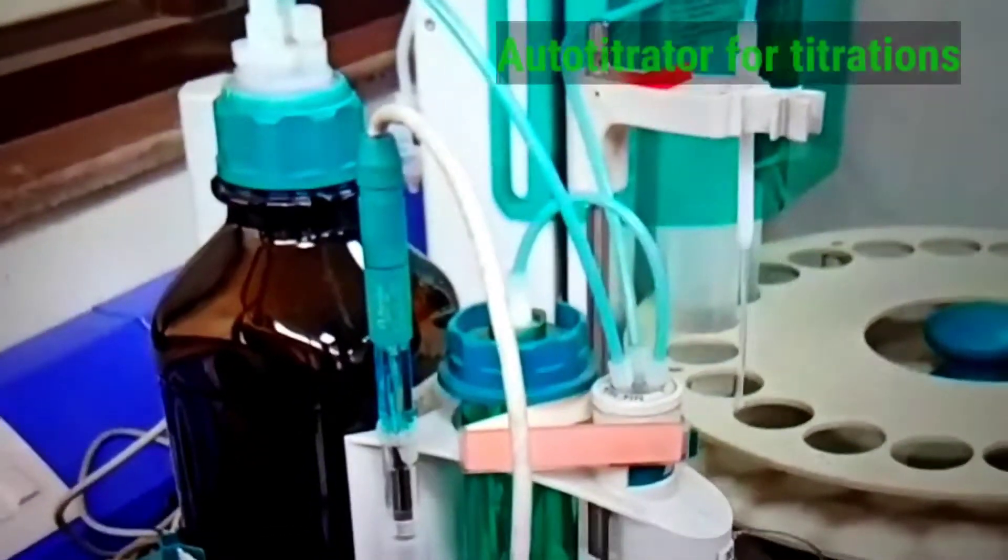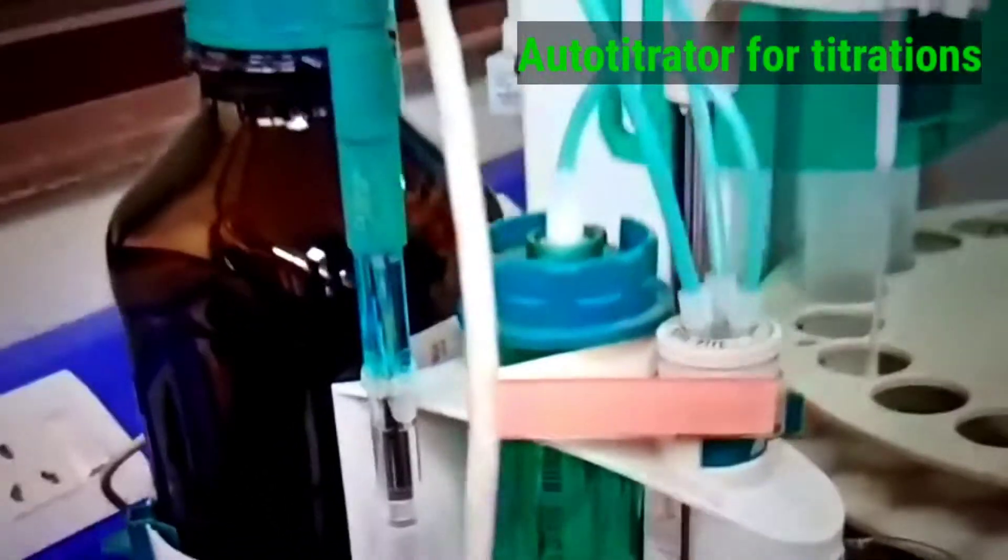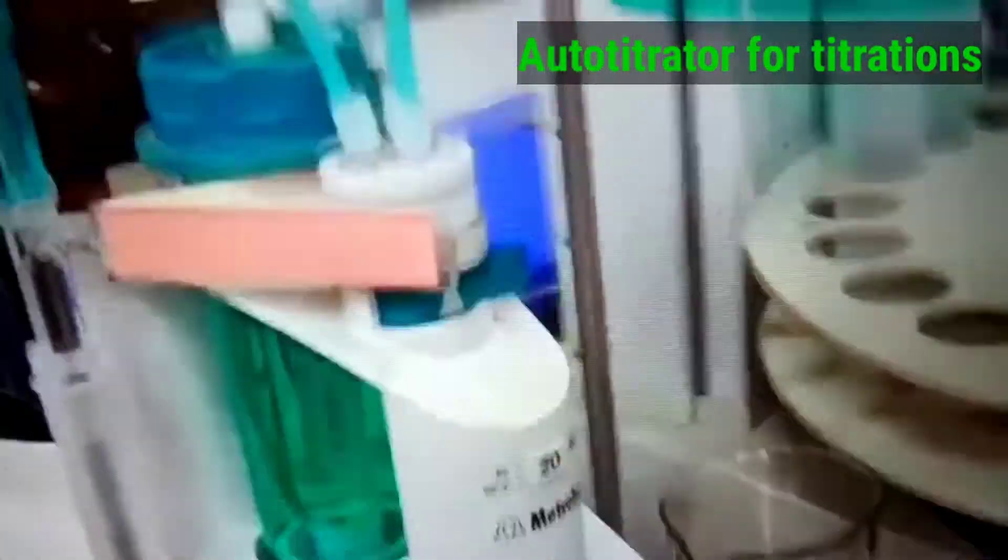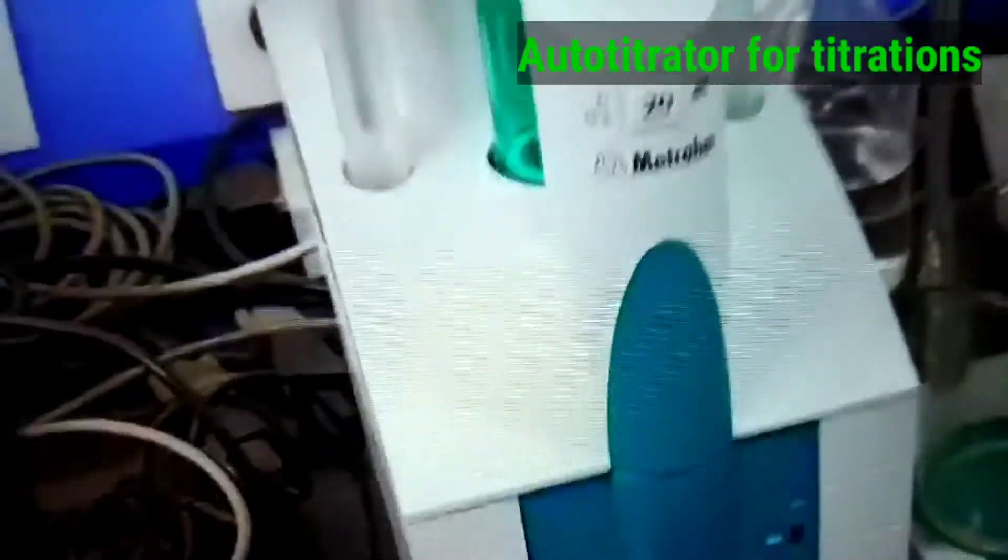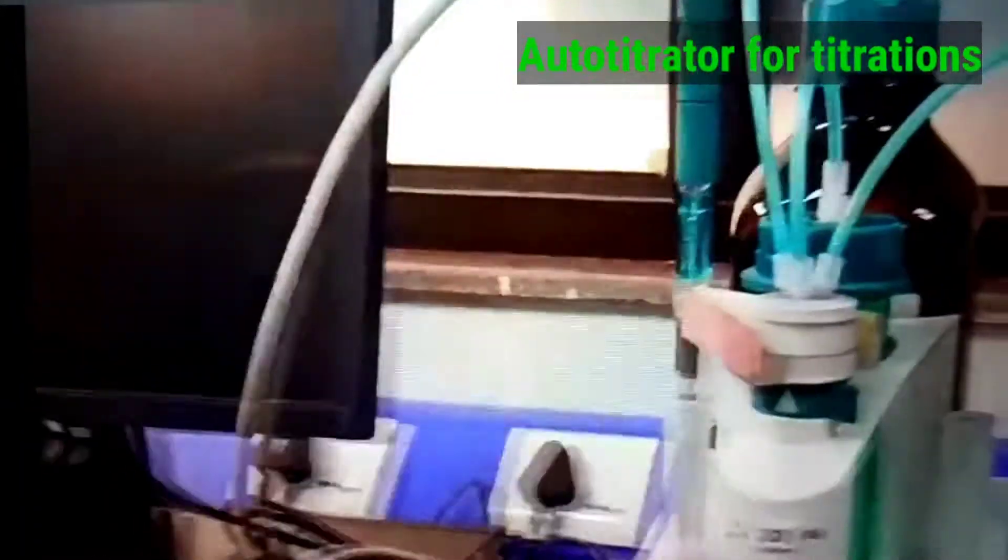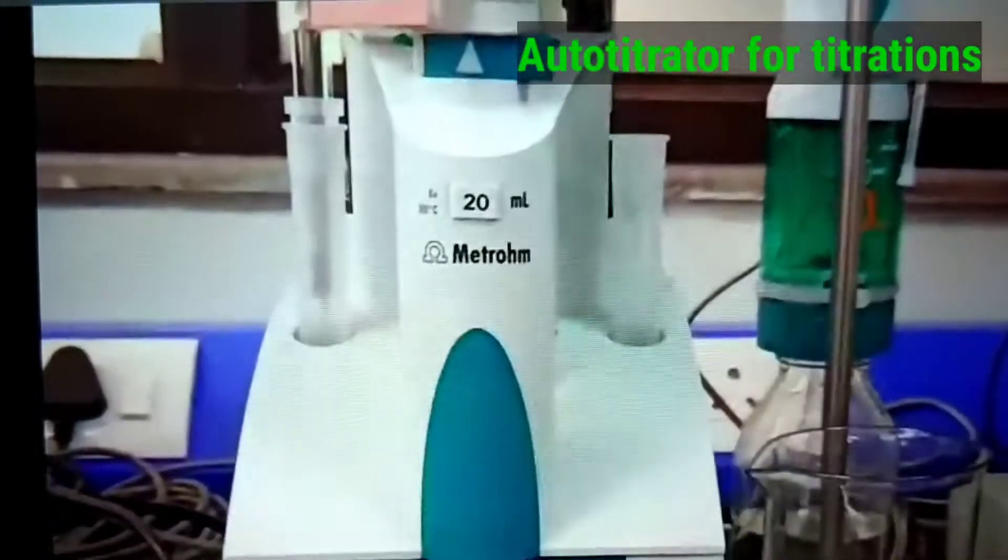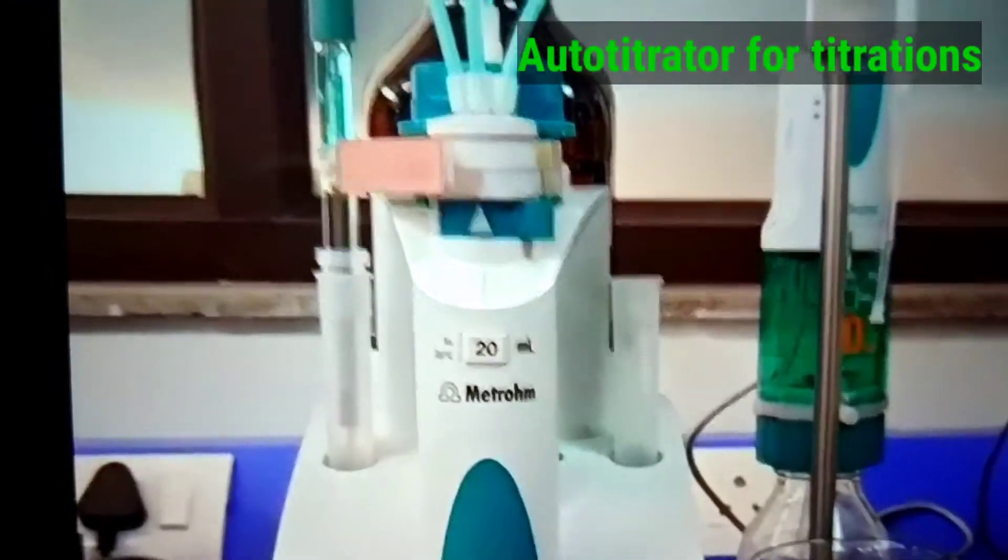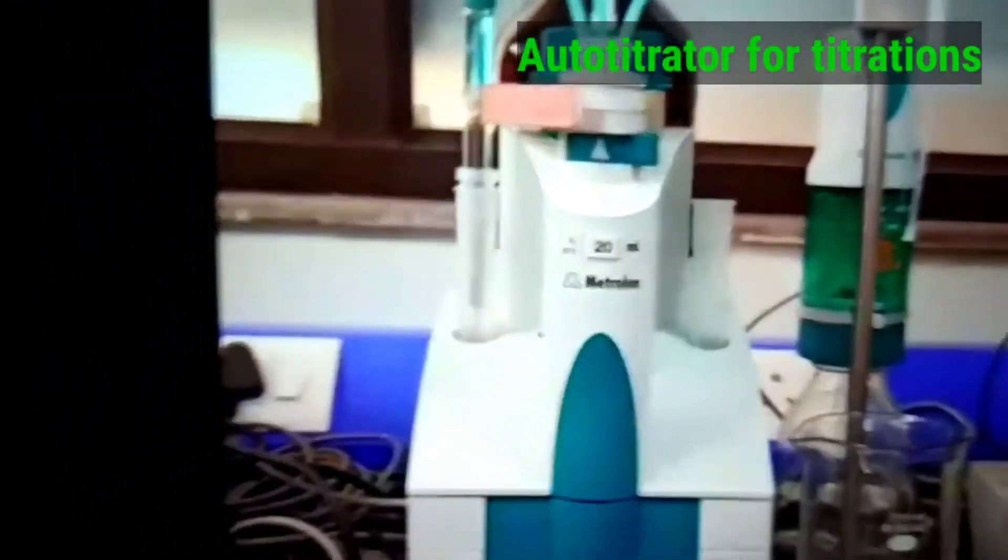We are doing acid-base titration. You know, in alkalinity we are doing acid-base titration. So in acid-base titration we are using one acid and the other is base.